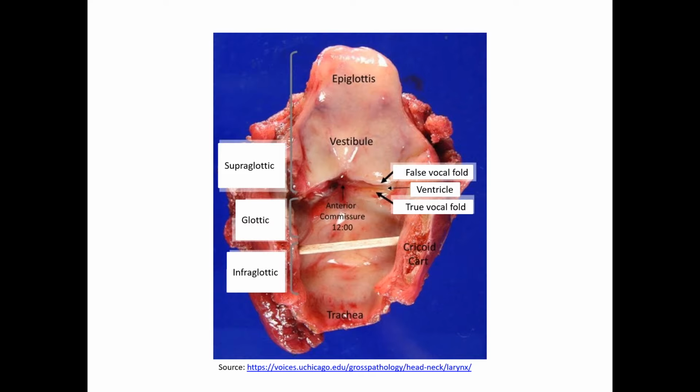Okay, let me continue my thought for a second there. So, the bulk of everything is on the gross and the larynx, particularly if you look at the CAP criteria. The overwhelming majority of the T staging just relies on both the clinical impression, the radiographic impression, as well as the gross findings. My job at the microscope is essentially to confirm gross findings and document whether it truly is tumor that's extending into a given area or whether it's just some kind of a fibroblastic response.